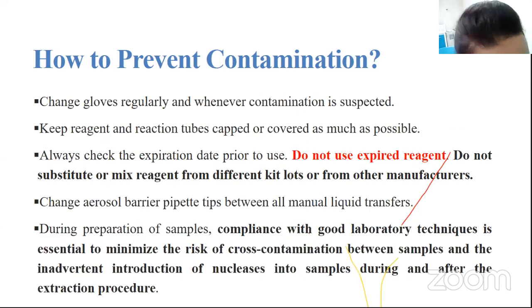You have, as shown earlier, to change gloves regularly, and whenever contamination is suspected, you have to change the gloves. Keep reagent and reaction tubes capped or covered as much as possible. Always check the expiration date prior to use. Do not use expired reagent.